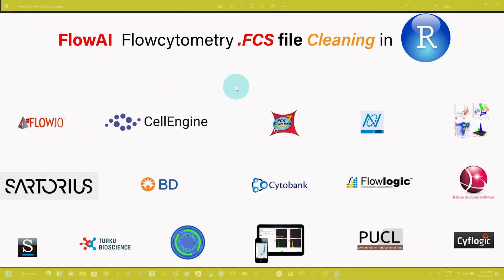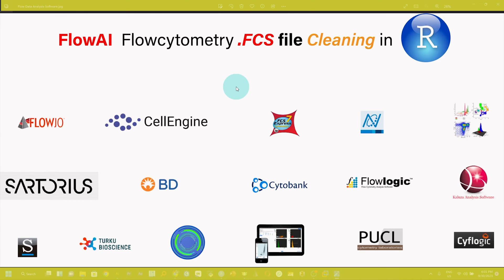Here I am showing various flow data analysis software that researchers use in their data analysis. But before analysis, it is very important to clean .fcs files using available cleaning tools. For this purpose, flowai is a very important tool.